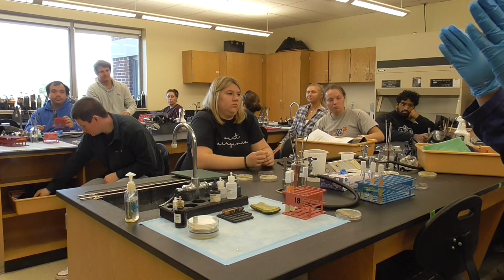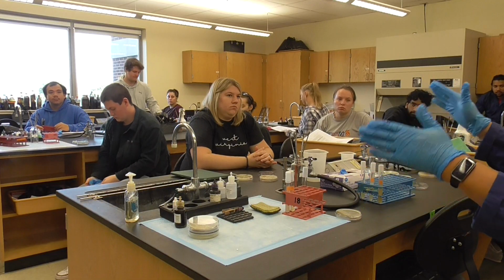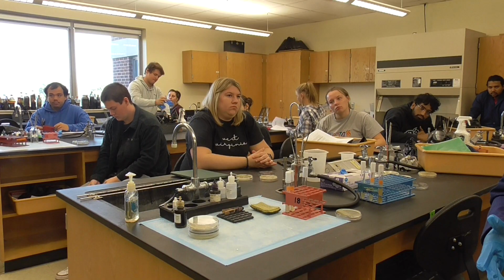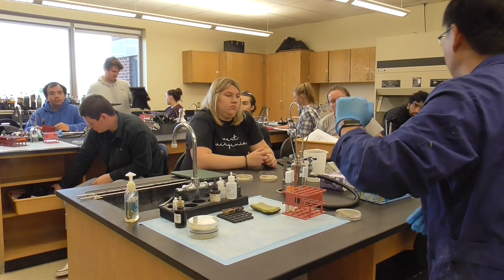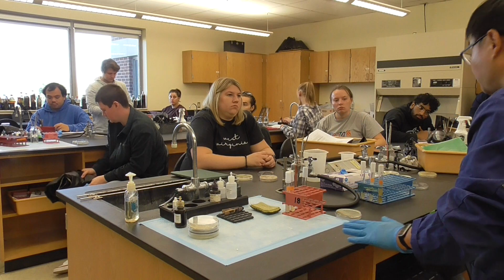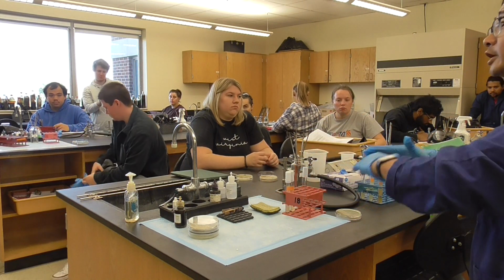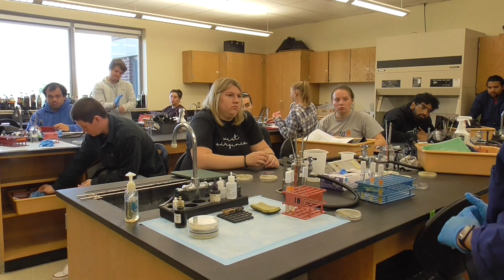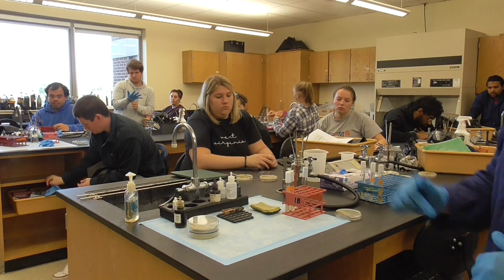And on Thursday, don't forget, it's not done. On Thursday, we have to do confirmation tests, which is you add H2O2, you add Kovac's reagent, and we're going to add ferric chloride to confirm it is positive. So today is inoculation, a preparation. On Thursday is the confirmation test. That's the reason we cannot do 5 or 6 at a time. Because otherwise you have another set that is a total mess. That's why we cut down to 2 or 3 each time. Okay? Go ahead and do it.